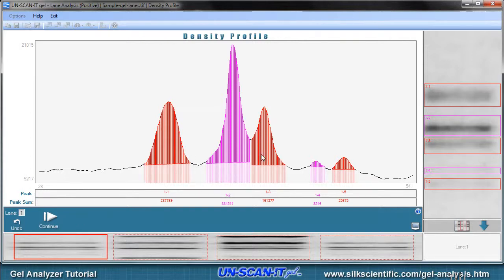Click the continue button to continue to the next lane density profile and follow the same procedure to define the peaks and baselines for that lane.